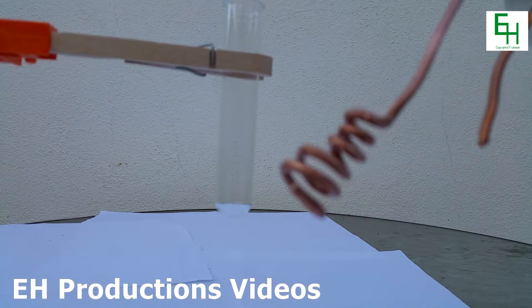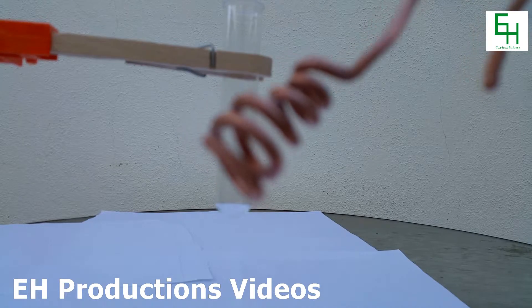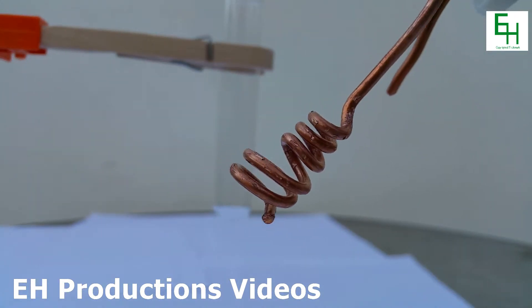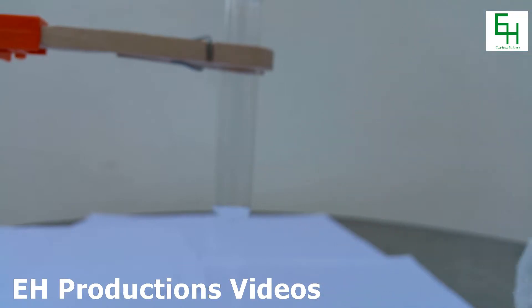Over here I have a piece of copper wire that I bent into a Christmas tree shape, and I'll be putting it into this test tube.